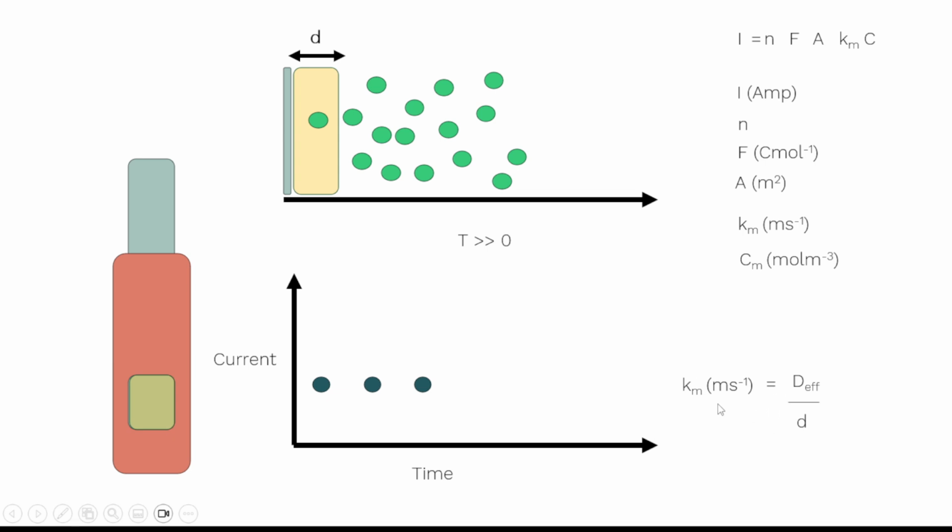But Km this time, earlier on I was saying, when it's a bare electrode, if you flow faster or stir faster or shake faster, you're essentially getting the liquid to move faster through that cell, and the faster Km is, the more current you've got. This time round, it's not so much sensitive to how you're mixing or stirring. It's actually more sensitive to that membrane, which is kind of what we want.